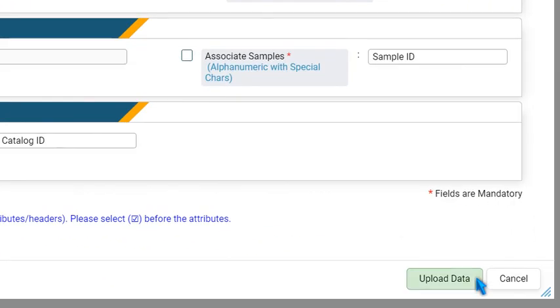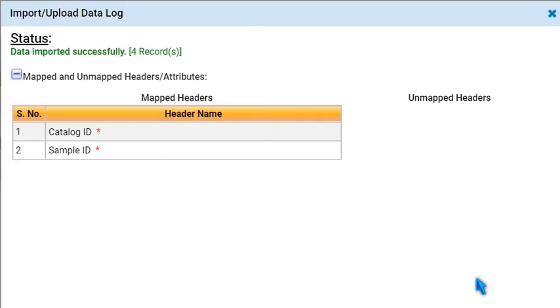Now press Upload Data. When the service request is successfully placed, the samples are added to the Samples module. The test requests are received by your lab if the service request is of a test, and the samples are associated with the tests to eliminate any transcription errors. This functionality is particularly useful for your customers who place hundreds of test requests or sample storage requests with your lab.